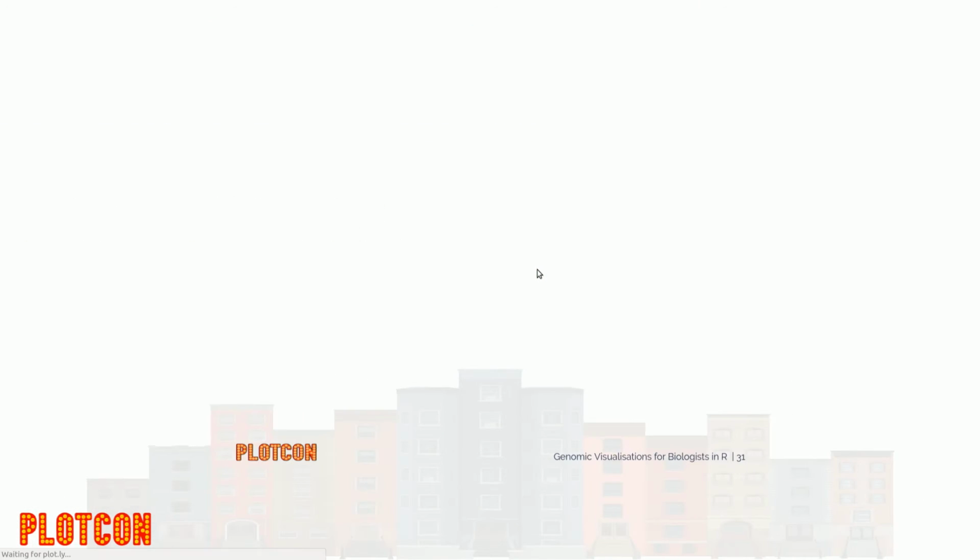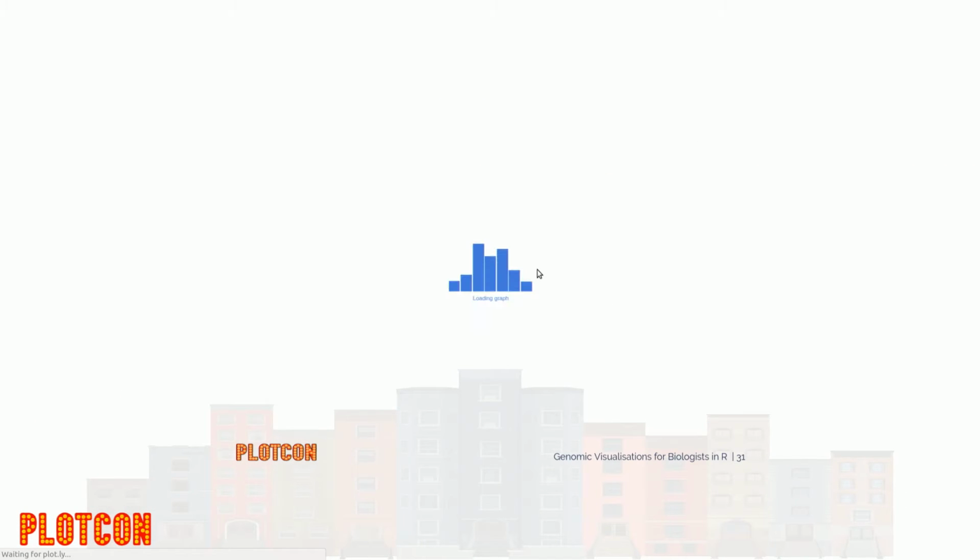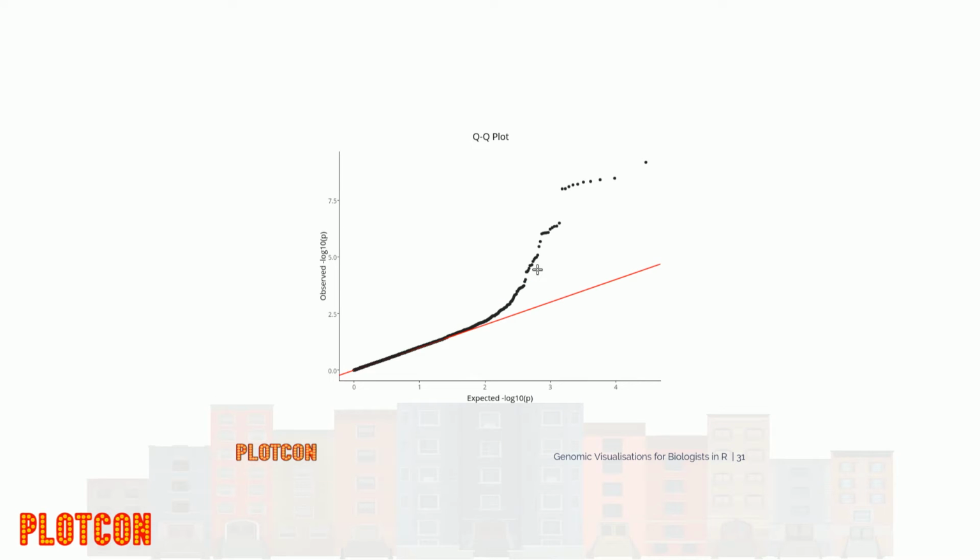And then this is the same thing for the QQ plot, which you can see. And you notice one thing, there's quite a bit of loading time, because the data set has like 14,000 observations. Maybe you could say that's a limitation, and 14,000 is a lot smaller than what a typical data set would look like.